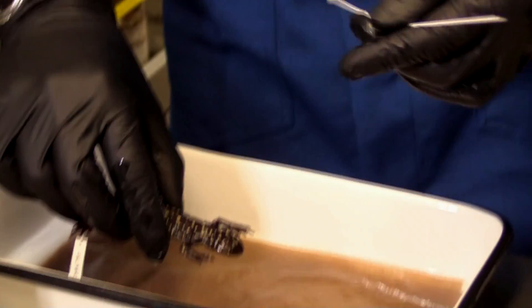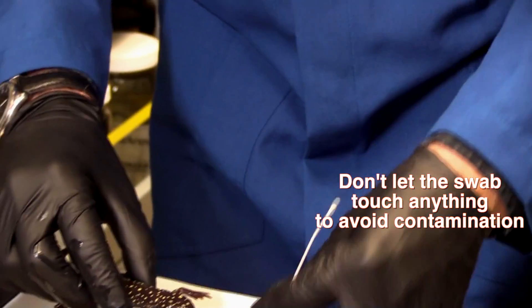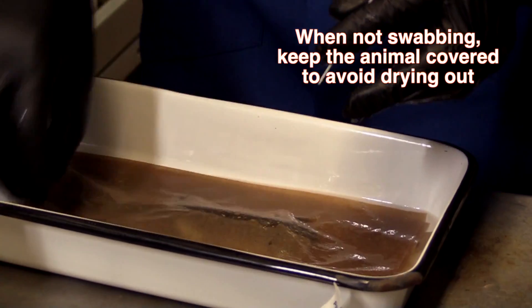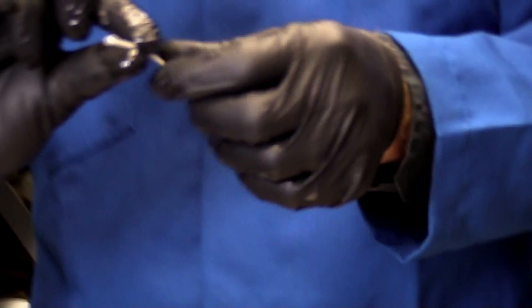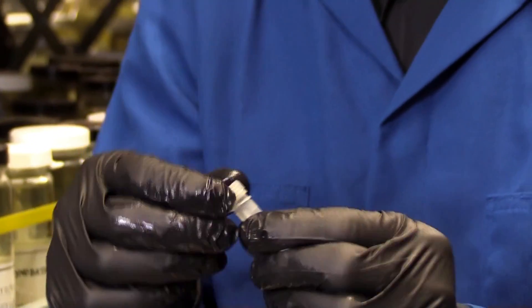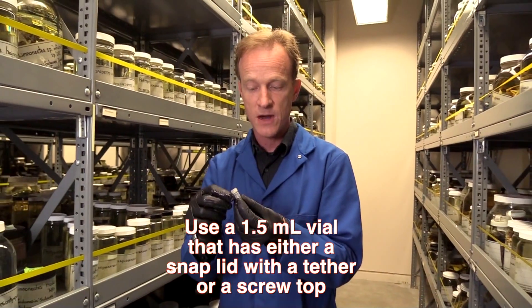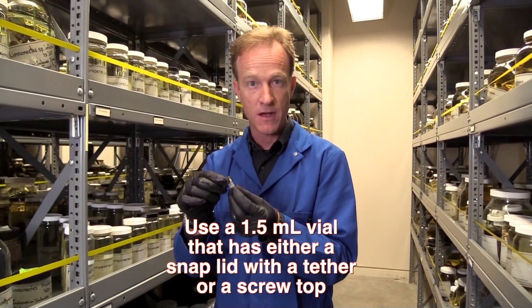I'm going to put the specimen down and keep the swab from touching anything else. I also want to cover the specimen with a moist towel so that it doesn't dry out while I'm finishing up — that's very important. Next, I break off my swab and put it in my vial. Now we're ready to extract DNA from that and see if it's infected. You want to have a vial with a locking lid, because when you do the extractions you have to heat up the vial, and you don't want the lid popping off — that's also very important.